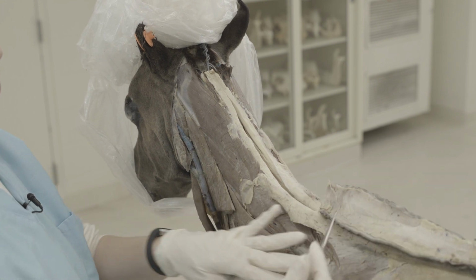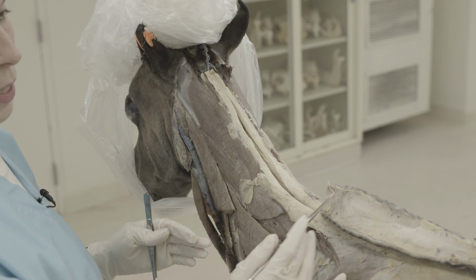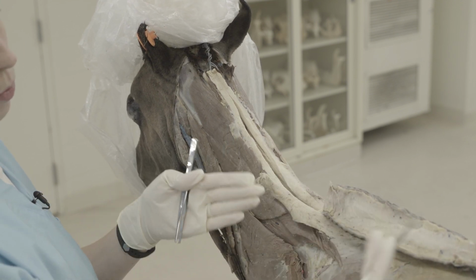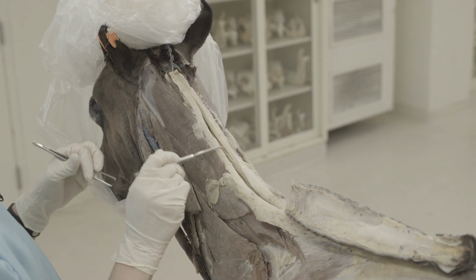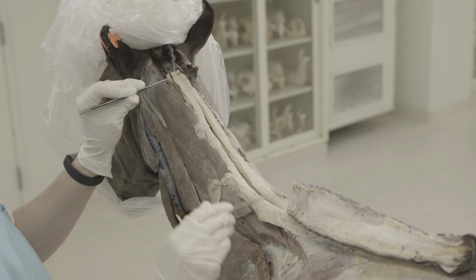And if you want to, you can actually just cut it off. And there's an optional part of the dissection where you can section this to see which part is the thickest, because there are regional differences. So the nuchal fatty crest is here, so I've reflected that, and now you can see the nuchal ligament right here. The nuchal ligament has two parts.